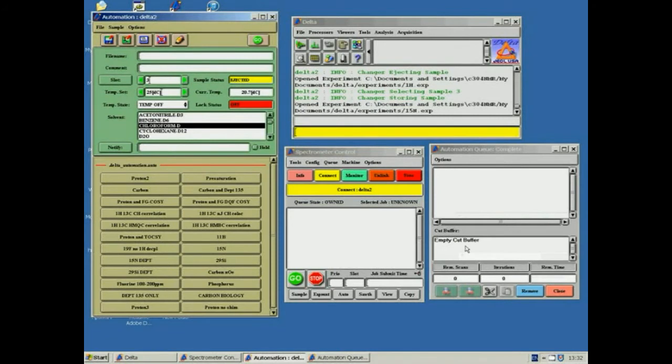Once the sample has been added to a numbered holder, the experiment is set up on the computer. Four windows will be active on screen: Delta, Spectrometer Control, Automation, and Automation Queue. If the queue window has been closed, it should reappear once another experiment is submitted. If the other windows are missing, please inform Dr. Lewis. The Spectrometer Control window should have a yellow box showing its connection to the spectrometer.